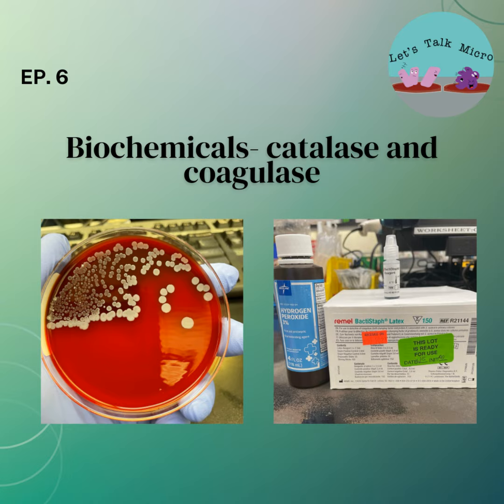And I have seen this, where a student is given an Enterococcus, they have this weak reaction, they call it a positive, they think it's staph, and then they end up doing coagulase, and they might end up saying that it's a CNS. Well, that's completely wrong. You know that there's a big difference between a CNS, coagulase negative staph, and an Enterococcus. Enterococcus are definitely very significant. They can be resistant to vancomycin. They cause nosocomial infections.